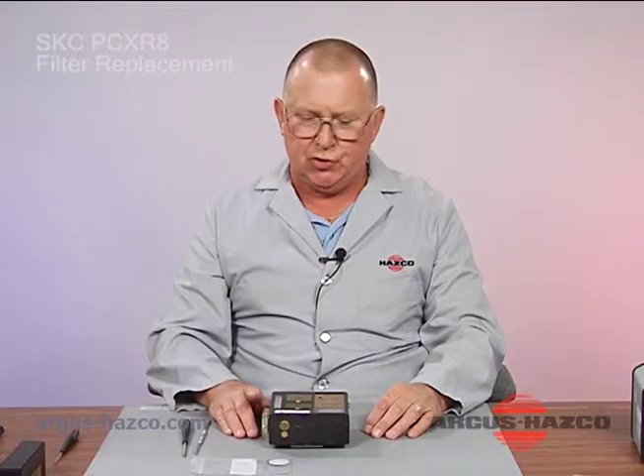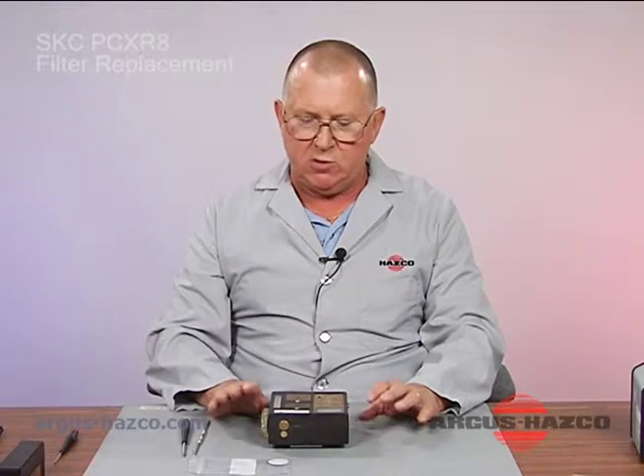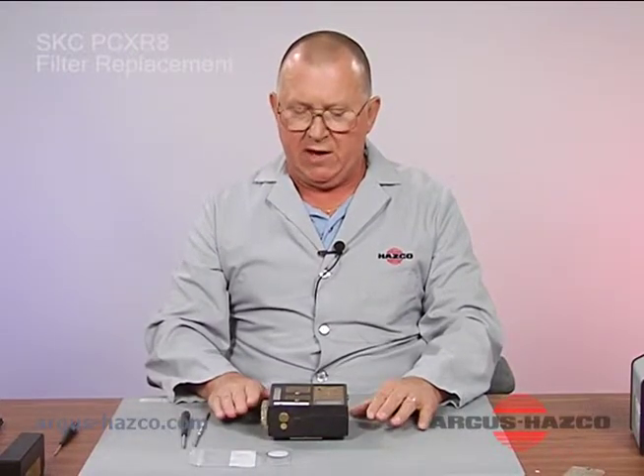In this segment we have a SKC pump model PCXR8 and we are going to show you how to replace the filter if it's dirty or worn. This will also apply if you have a PCXR4 model XR or any of the other PCXR7s. The model we have here is a PCXR8.